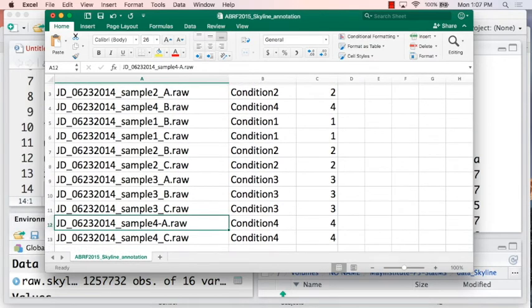If you make this one like this, they lose this information, and now we use only 11 of the run information instead of the whole 12 lines. So the annotation file should be exactly the same as the raw file name in the output. That is a common mistake.